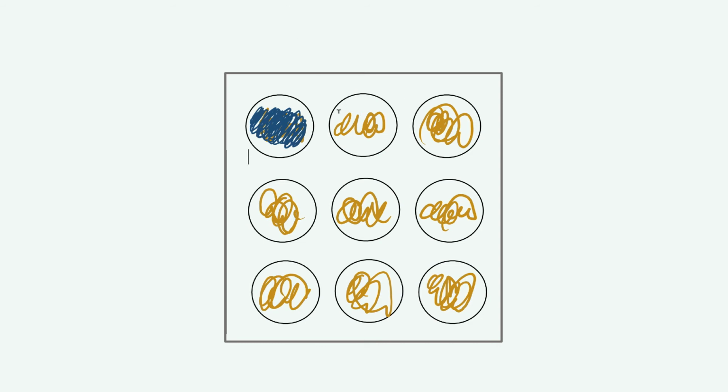And so we keep adding it. Keep adding it. Next 30 seconds, right? So this is after a minute. It's still there. Then we add some more to this one, and it's still there, and some more, and another one, it's still there, right? So that means that after 30 seconds, 1 minute, 1 minute 30, 2 minutes, we still have starch present, which means the reaction has not finished.